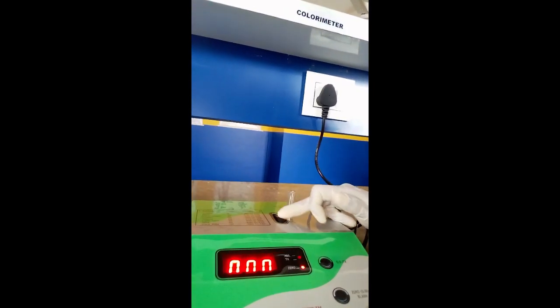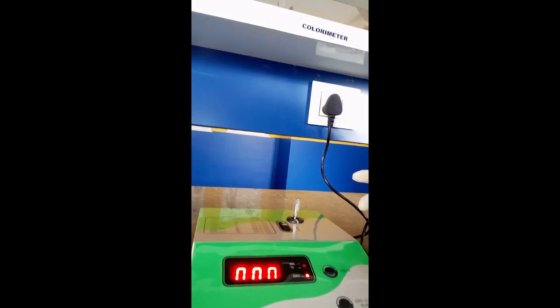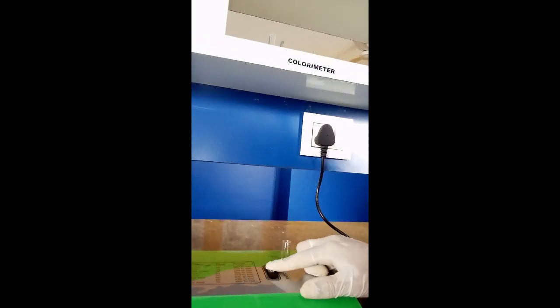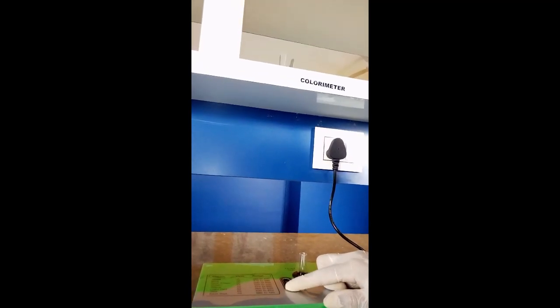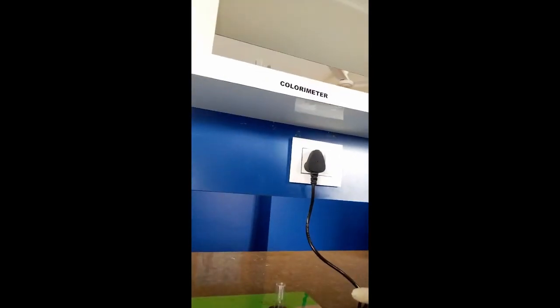So this is the filter wheel, and there are a total of 8 filters here. You can just rotate this wheel like this, and you will select whatever filter you want. So in this way you can change the filter and take the readings.